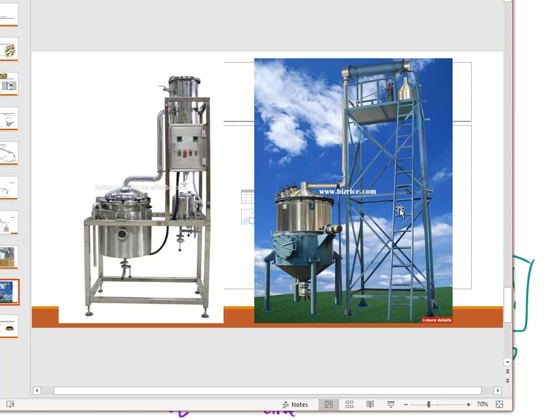And then over here to the right-hand side, you can see that these things can become much larger depending on what the product is and what the manufacturer is, where the collection jars are basically going to be way up here at the top, and you're going to have to take a ladder in order to get those essential oils or whatever is distilled from the steam distillation setup. So that's kind of how this translates to industry. That is what the regulated type of mechanical parts would look like at a company if you are blessed to work in one of those.